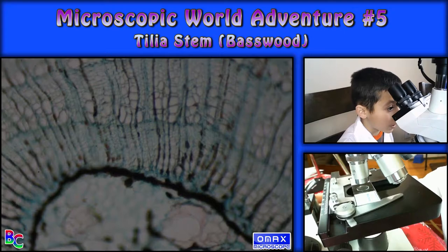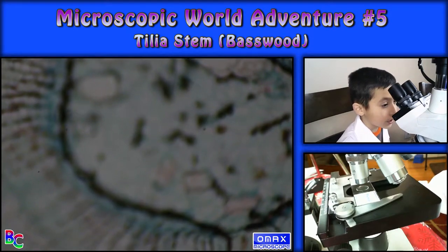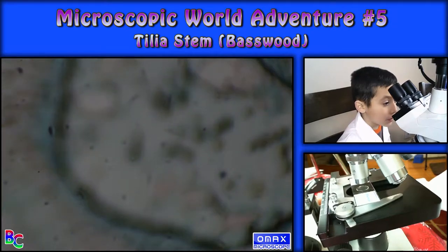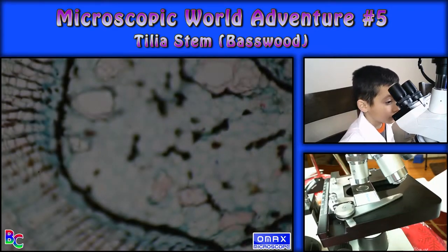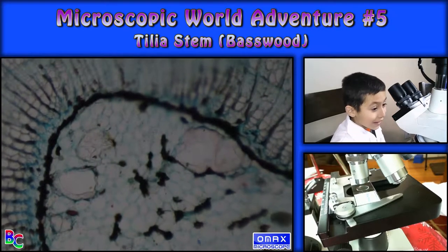What was that? Oh my. What is that? There's a black thing in the middle. I have no idea what that is.